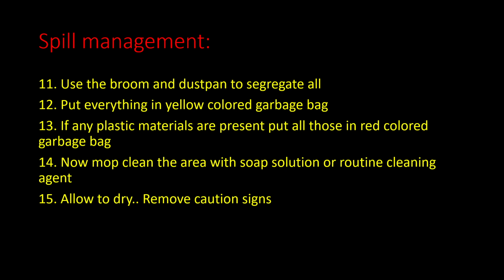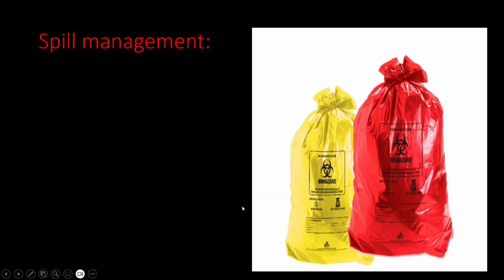Now once all the adsorbent material has been removed, mop the area clean, use the soap water or the disinfectant solution and clean the whole area. Allow the area to dry, and once everything is dried and it is as good as before, then remove the caution signs.